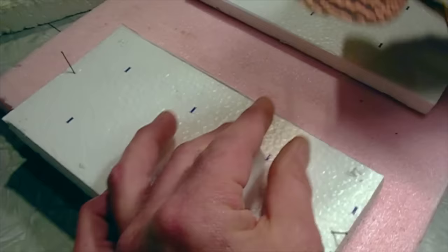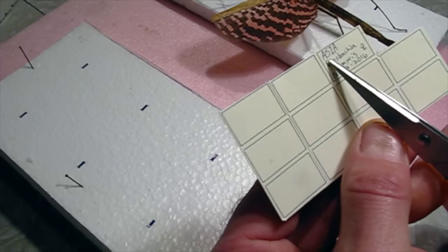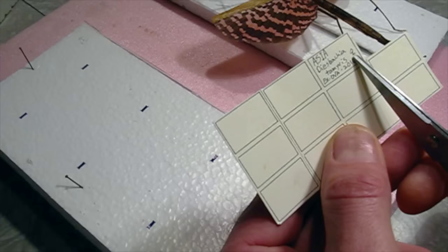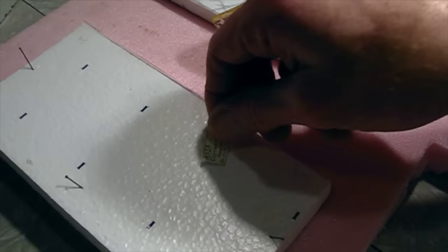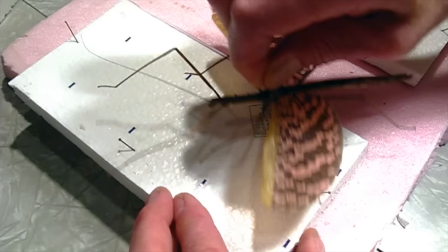Now we'll put a label on it. I don't really have accurate data on this since it's raised in captivity, so the only information I can put is Asia — it's an Asian species and I don't know what country it's from. Diasbachia tamiris is the species, and then the female symbol — it's a female. I say ex ova, which means it was hatched out of an egg and raised, and the year 2016. Always important to have labels on everything with whatever information you have. Put the label on the pin — the specimen is done.